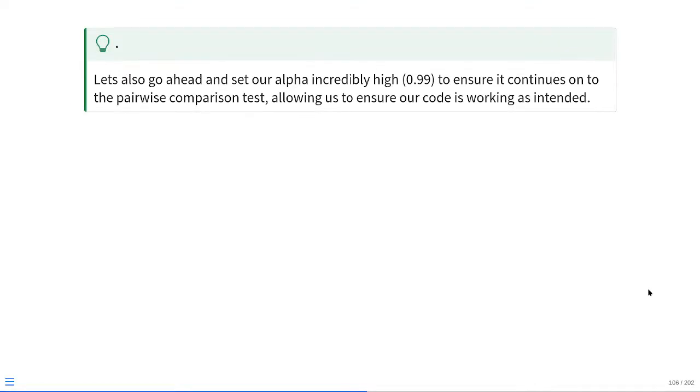We are going to have to go ahead and refresh the function by running it and then check the output. But for this data set, this is only 10,000 T cells that are all off of cord blood, where I'm not expecting to have much cytokine, and I'm honestly not expecting much differences for the p-type column at this point. So we're likely just to get a bunch of non-significant values being returned to us right off the bat, and we'll never be able to evaluate whether the pairwise t-test code is actually working properly.